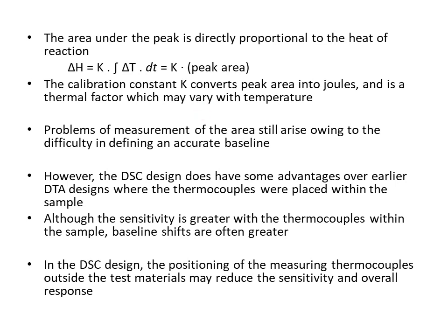The problems of measurement of the area under the peak still arise owing to the difficulty in defining an accurate baseline. So if there is a shift in baseline, as I mentioned earlier, then it becomes quite difficult to measure the area under the peak, or to properly define the area of the peak.